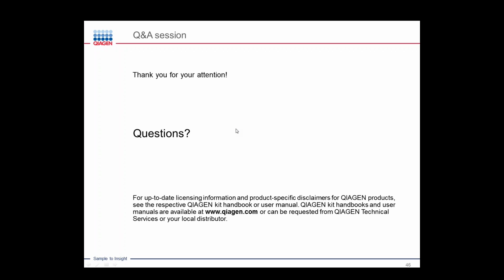If you have a standard RNA extraction, let me say from cultured cells, and you're using a guanidinium hydrochloride based extraction reagent, you will not obtain an influence on your 260-230, as I showed. Even at high concentrations, there will be no influence. So it depends on your setup.